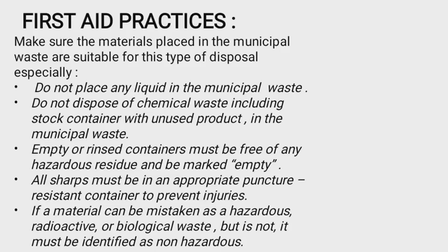Empty or rinsed containers must be free of any hazardous residue and marked as empty. All sharps must be in an appropriate puncture-resistant container to prevent injuries. If a material can be mistaken as hazardous, radioactive, or biological waste but is not, it must be identified as non-hazardous.